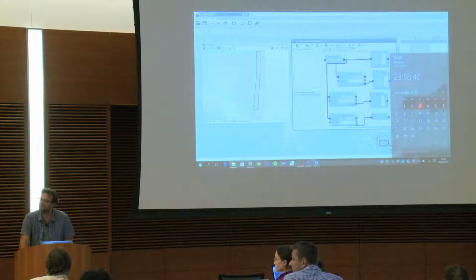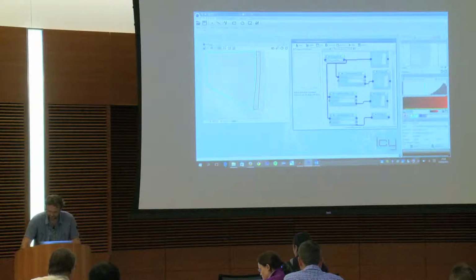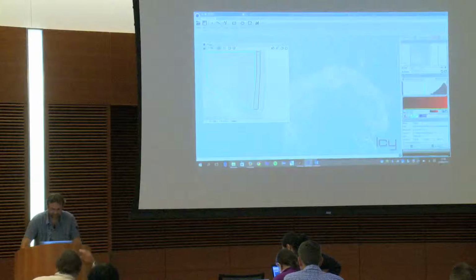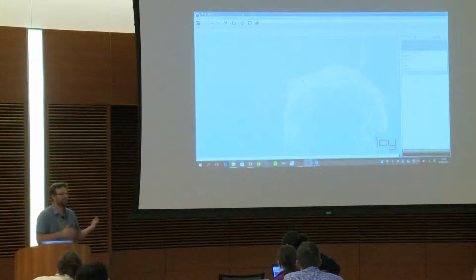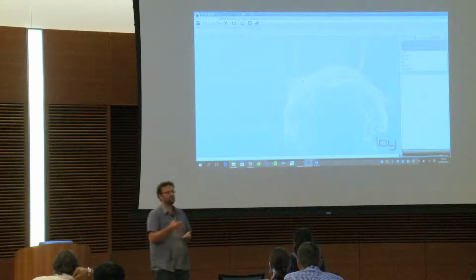So we still have, it's... Okay. Okay. Okay. So now it's going to be a little bit, what do you want? I like to do this, it's quite challenging, and we can do it.